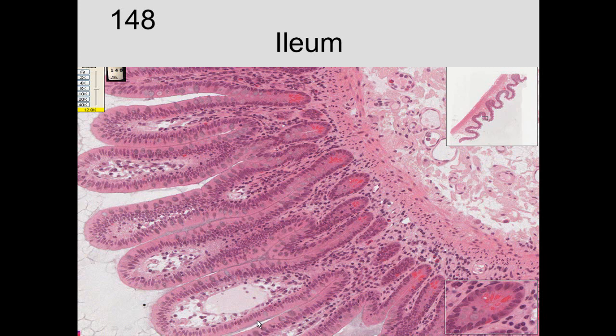Nuclei, cytoplasm, columnar cells, connective tissue, muscle layer in through there, and more connective tissue, as we see. At the base of these cells, you also have another type of cells. These are the Paneth cells. The Paneth cells secrete enzymes to kill bacteria that go in through there, and we'll learn about those later on. But right now we're concentrating on intestinal absorptive cells located right in through there. And here we can see throughout a little mitotic activity. These are metaphase plates associated with the production of new cells.